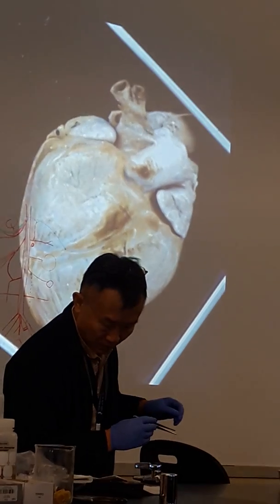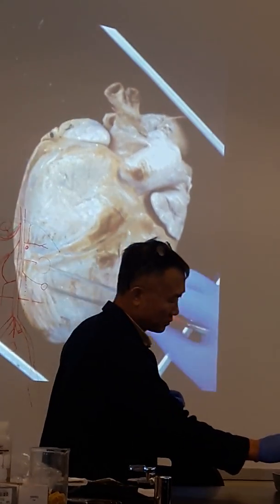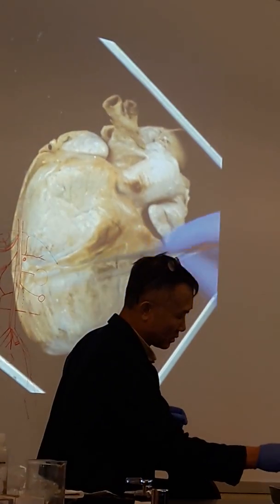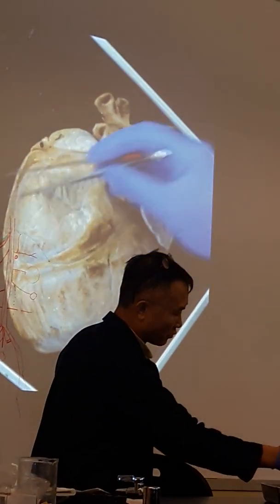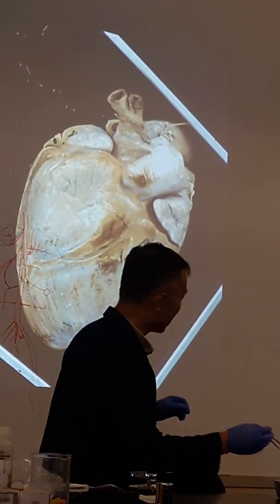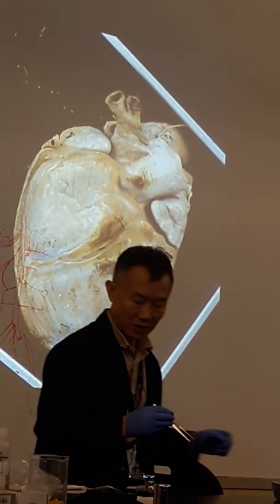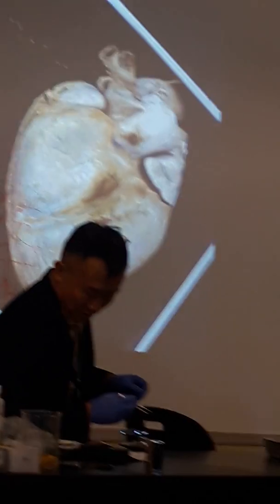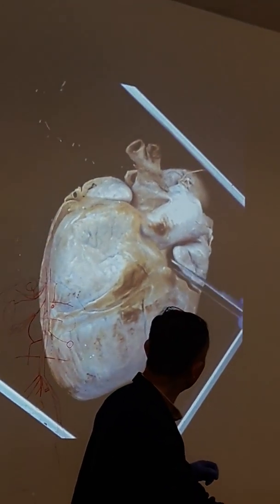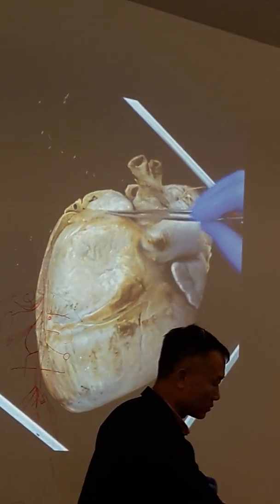Okay. Left ventricle, most part of the apex. Okay. See the line over here? This is the right ventricle, and this is left ventricle. Okay. So front view majority part is the left ventricle. Coronary sulcus. This is the coronary sulcus. Coronary sulcus by this side.